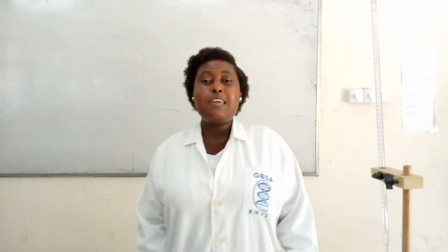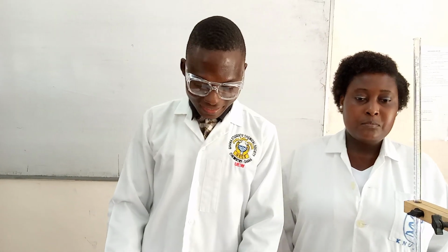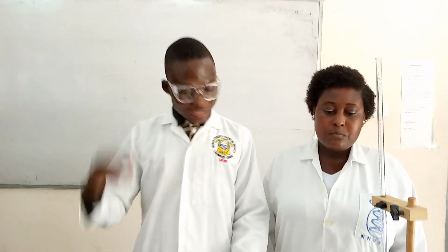Yes, so his name is Mr. Suleiman Lab. He is going to take us through the procedure and the things we will need for the practical. Hello viewers. As my colleague said earlier on, I'm going to take you through the practical itself and the chemicals you need to undergo this practical.